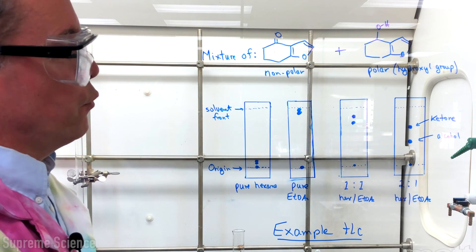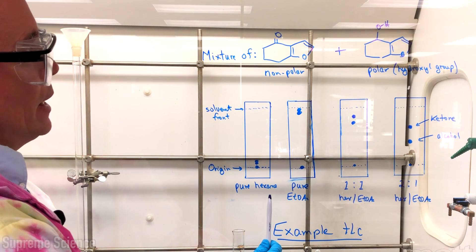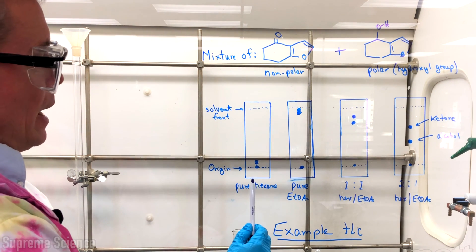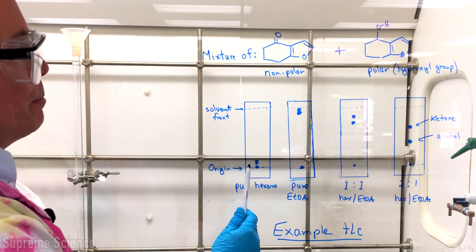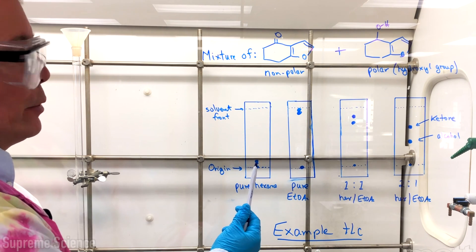So we ran four hypothetical TLCs. The first one we ran in pure hexane, this mixture of compounds, and hexane being non-polar does not push the material up the TLC plate very far so both spots appear at the bottom. This is unsatisfactory.